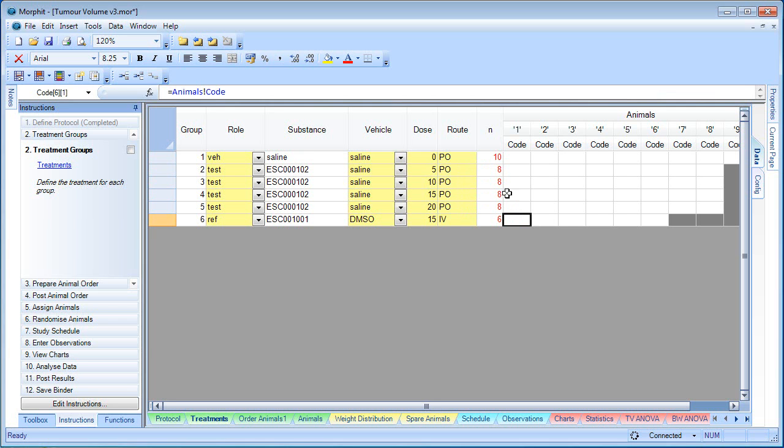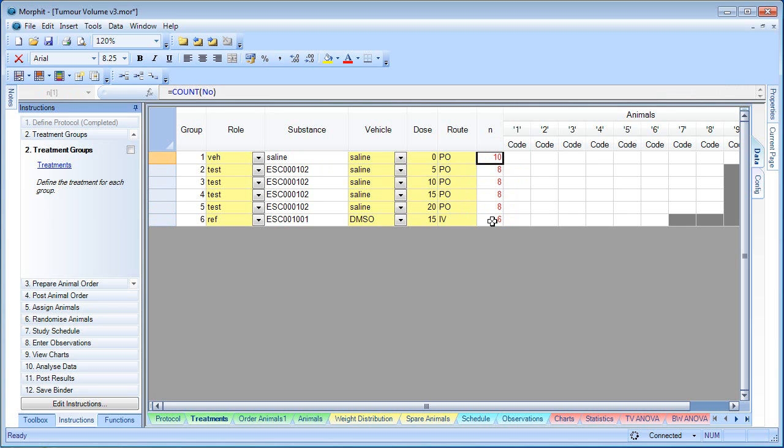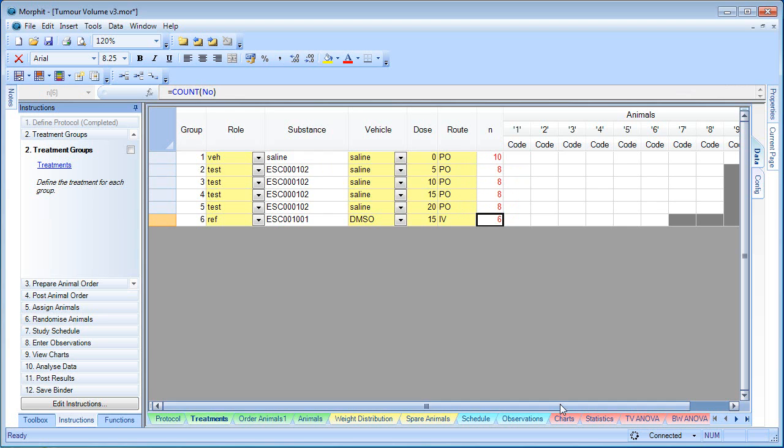We can see that the test groups have eight animals in them each. The vehicle has ten, and the reference compound is just six. This is represented by the pivoted animals. If the animals had been assigned, we'd see their code number here.